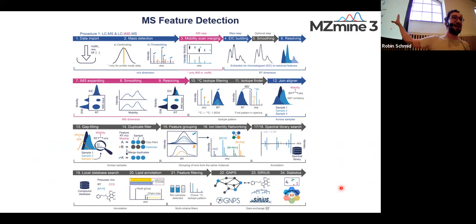But the nice thing is that everything is modular, so you can just send this configuration that we do. You can save it, you can send it to a collaborator, you can also publish it with your paper. So if you already have a GitHub repository, for example, where you code your figures, or you have Zenodo, or you put anything anywhere, you can just drop the batch file with it, and then people can directly reproduce. There's the MZmine version in it. It's always good to still define it, but there's the MZmine version, and also all the steps have a version, so people can really reproduce it.